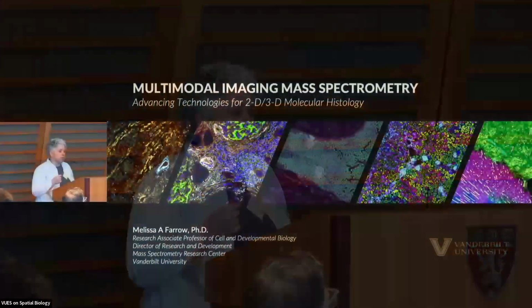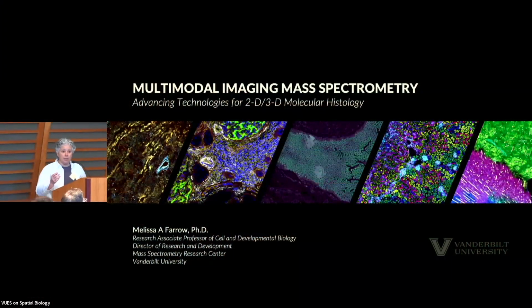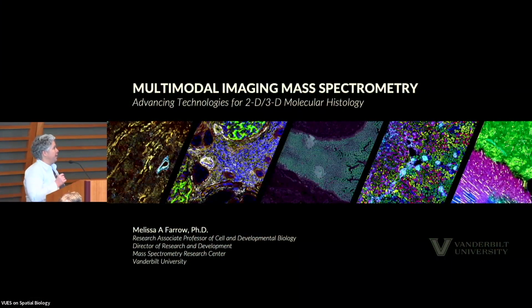I'll be presenting today on behalf of the Vanderbilt Biomic team, and I'll be describing to you our multimodal imaging pipeline with a focus on how we initially developed the methodologies in 2D, as well as the accompanying software and tools that we use to both integrate and interrogate those assays, and then how we're actually dragging our approach into the 3D realm.